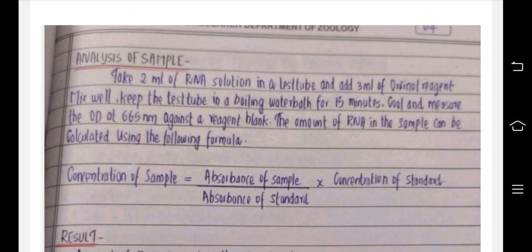Analysis of sample. Take 2 ml of RNA solution in a test tube and add 3 ml of Orcinol reagent. Mix well. Keep the test tube in a boiling water bath for 15 minutes. Cool and measure the OD at 665 nm against a reagent blank. The amount of RNA in a sample can be calculated using the following formula: concentration of sample is equal to absorbance of sample divided by absorbance of standard, multiplied by concentration of standard.